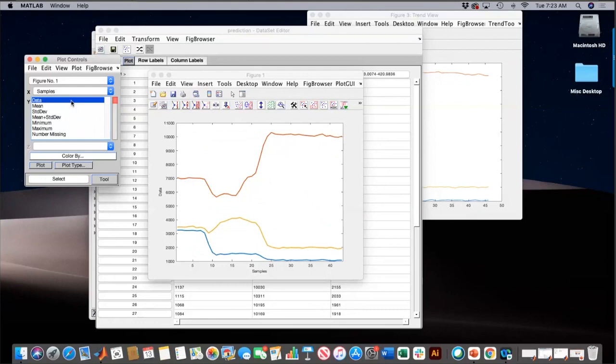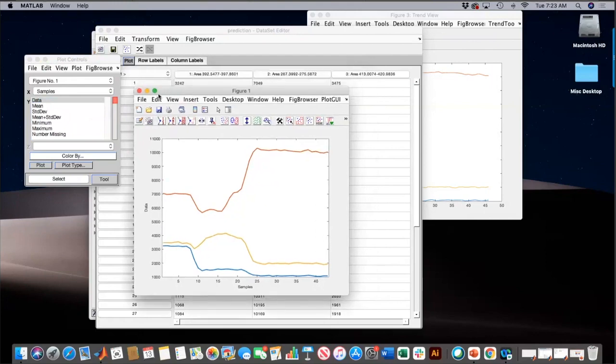Then if you've got multiple ones of these and you want to look at how they all looked in time over these features, I can imagine doing this with a set of engineering variables here too. This is spectra, but this is what we get there. Okay. How am I doing, Scott? Any questions so far or things that I'm forgetting?